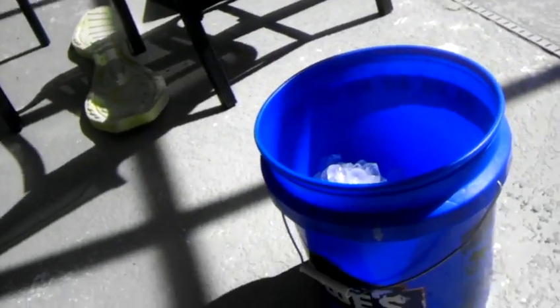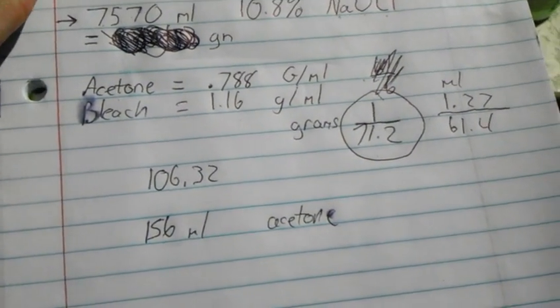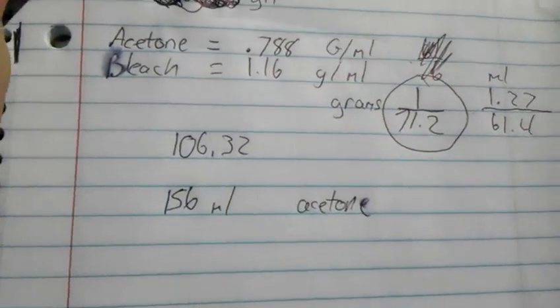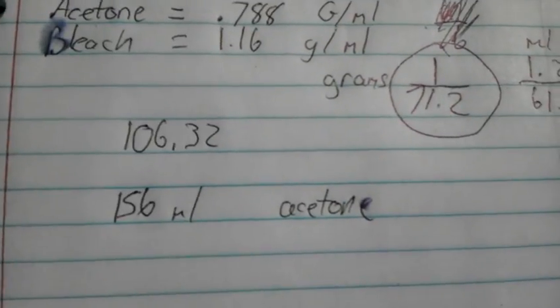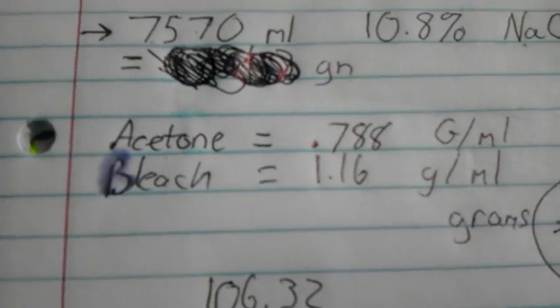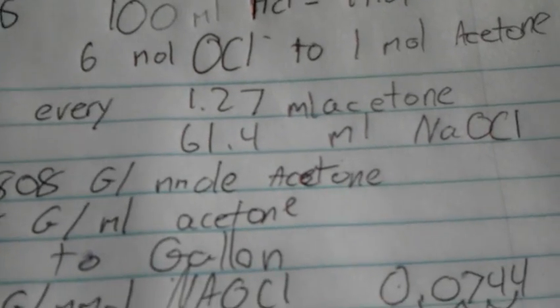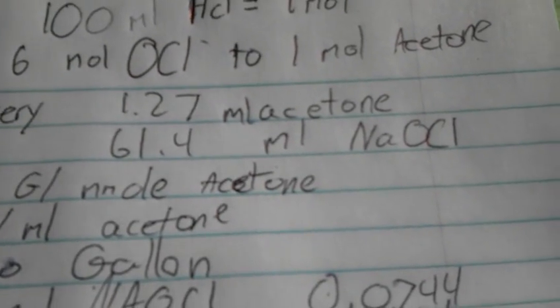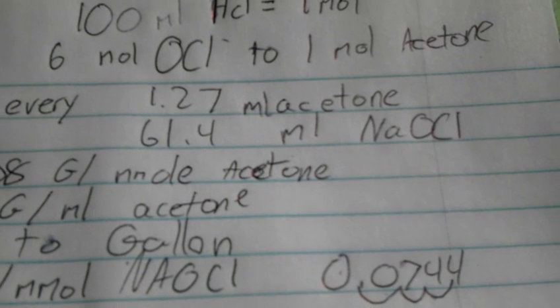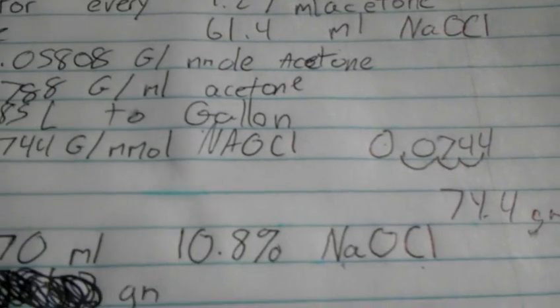A lot of people — the main thing about this is you have to get the volumes right. You do not want to have excess acetone or else it's really going to mess up your synthesis, because acetone is going to dissolve in your chloroform or something. The ideal ratio is for every 1.27 milliliters of acetone, use 61.4 milliliters of sodium hypochlorite 10% solution.